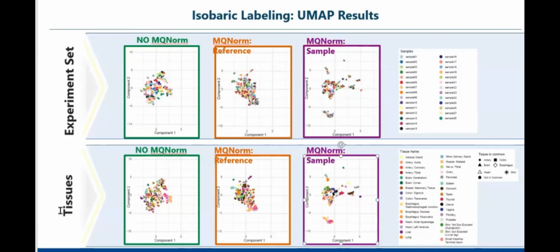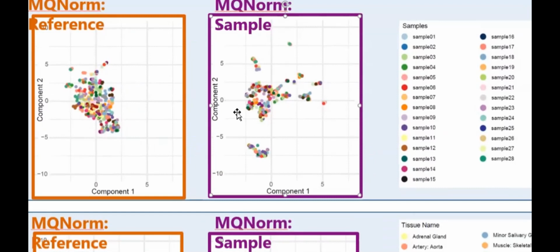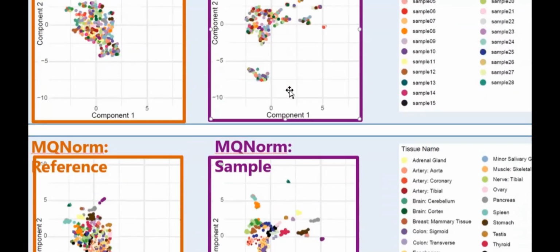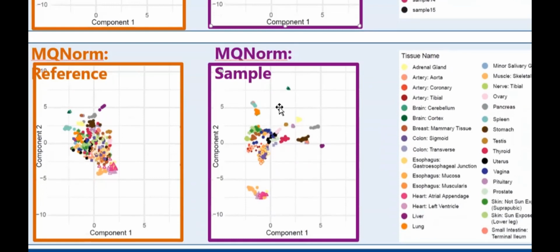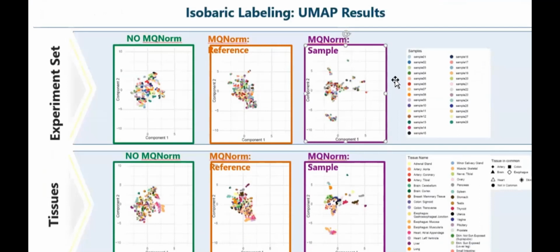Here it is colored based on the tissue. And here it is colored based on the set of experiments, the one that we called S01 before, S02, and so on, that we have almost 28. And for sure, maybe I can zoom. You see that it's not clustering based on the sample, the set of experiments, sorry, but for sure based on the tissue. But this is exactly the case that we did together.